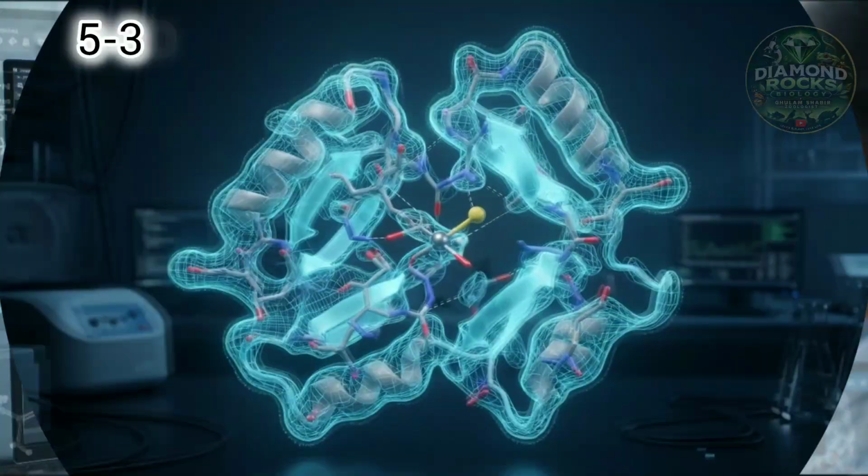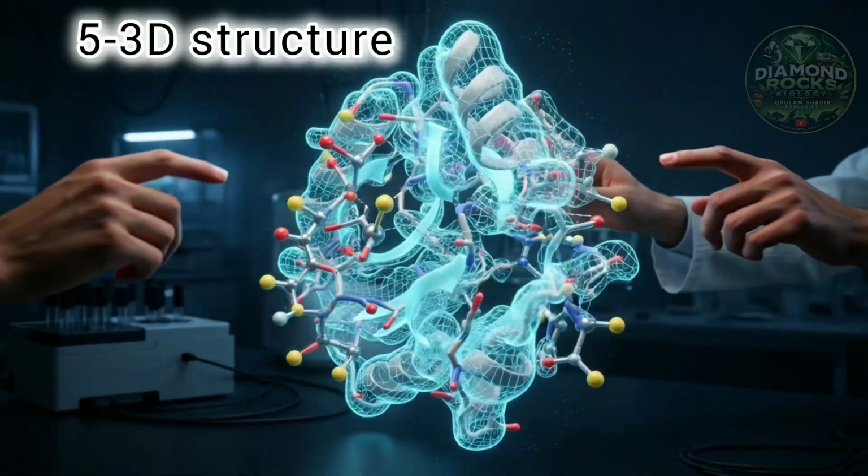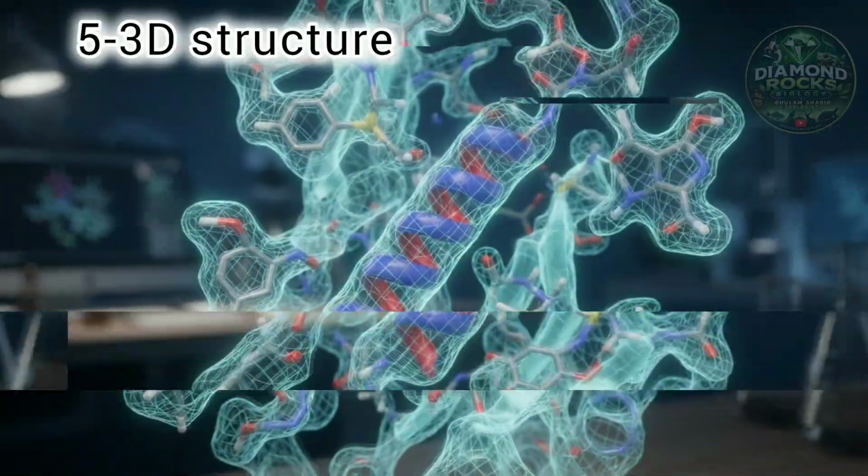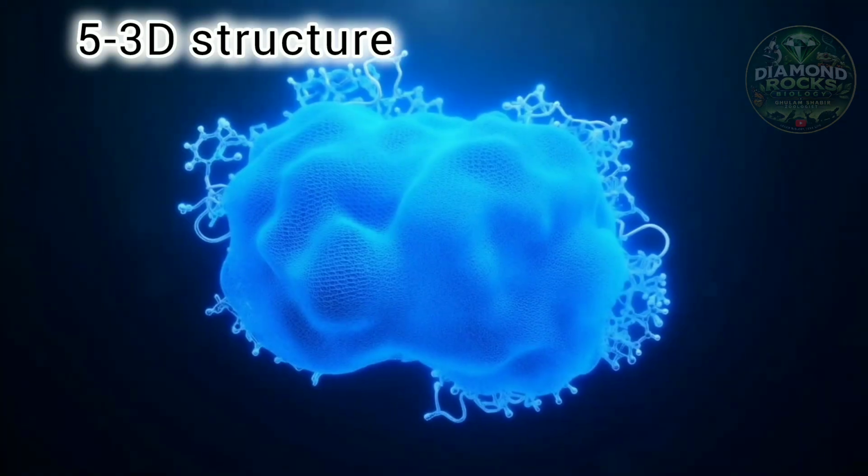5. 3D structure is determined. The information is used to construct an electron-density map from which scientists can determine the positions of atoms and build the molecule's 3D structure.